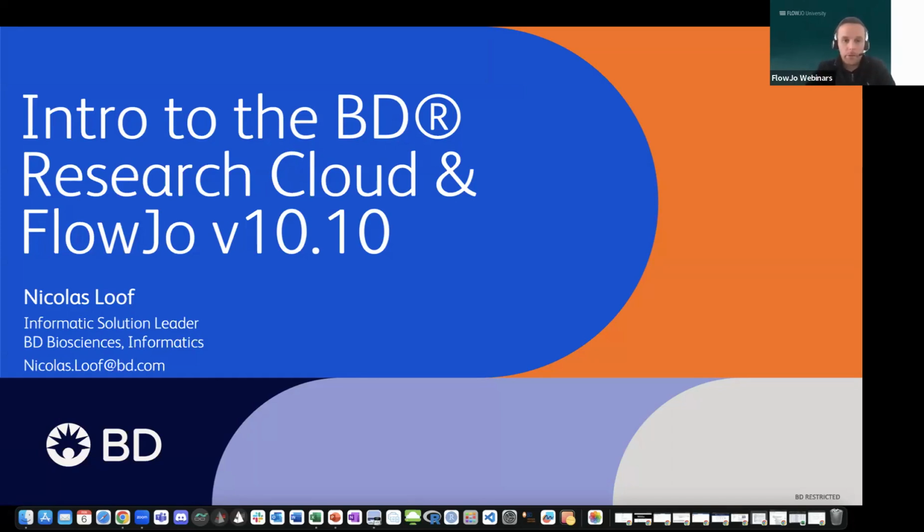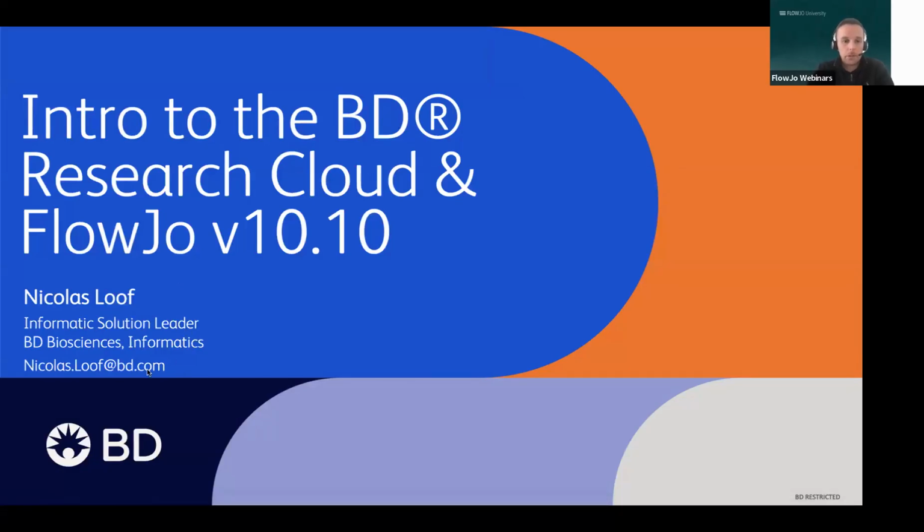I'm Nicolas Loof. I'm an informatics solution leader at BDB Informatic, aka FlowJo. I put my email address here on the slide. Don't hesitate to reach out to me if you have any questions. And today we're gonna talk about the BDRC and FlowJo v10.